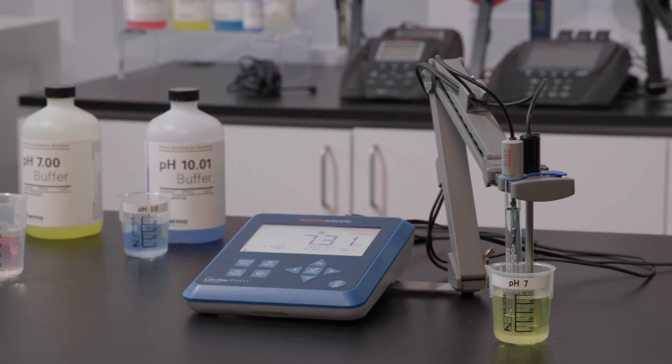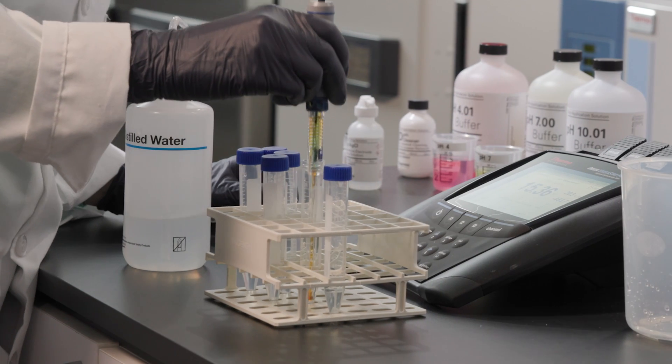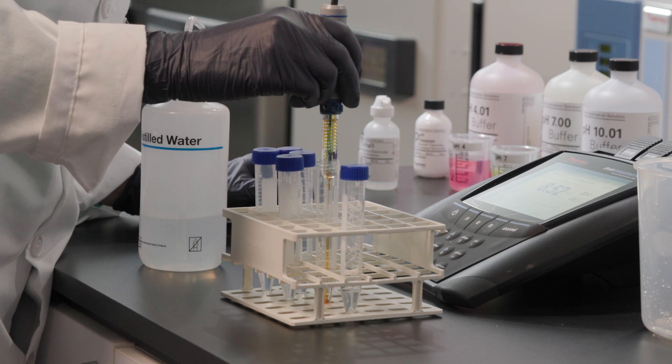As you tackle common laboratory tasks, including measuring pH, it's important to understand your samples so you can choose the right equipment. Although pH testing seems simple, it can be complex and not always easy to understand or get right.